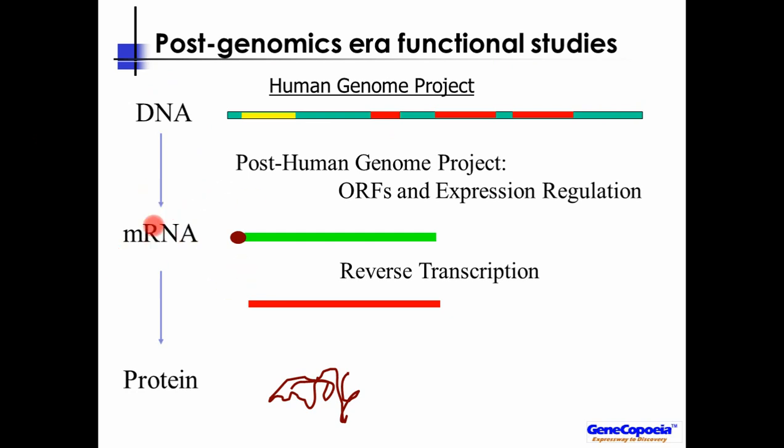Well, naturally you make mRNA, and mRNA makes protein, so in order to do this, you need clones and you need ORFs in order to analyze various aspects of their biology, from either studying the regulation of the gene expression or by studying phenotypic effects of protein overexpression or mutated proteins being expressed, etc.